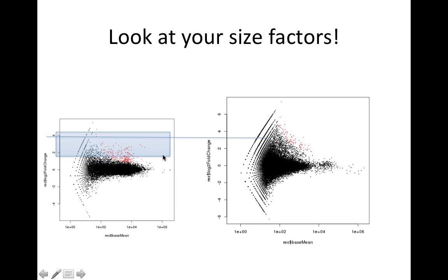So if I were to take only these genes that are actually differentially expressed, go back to the original file and filter the original file to throw in only genes that were differentially expressed, which I'll tell you why in a minute, that would be something you would do. If you then run it through DESeq, you'll see that these red dots aren't red anymore. Most of them go back into the black. The reason for that, remember, is that we're normalizing. So if you give it nothing but genes that are differentially expressed, it will normalize the two lists because it wants the same number of reads in the two lists. And you will end up with none of them being called as differentially expressed.